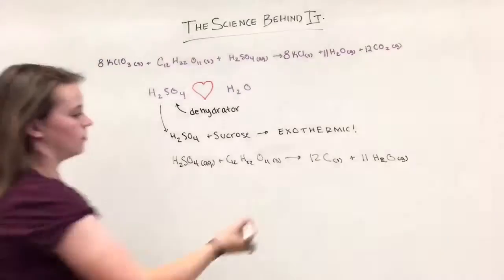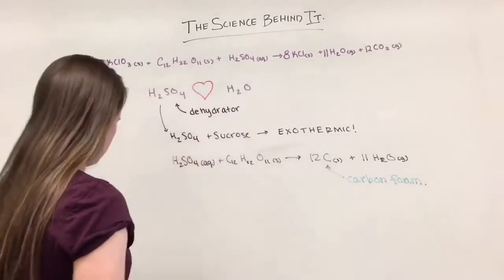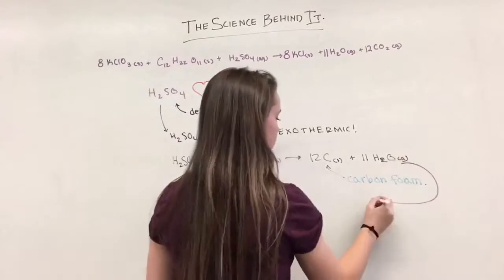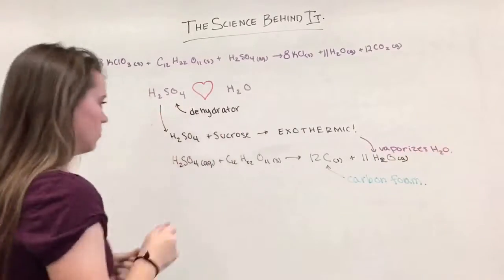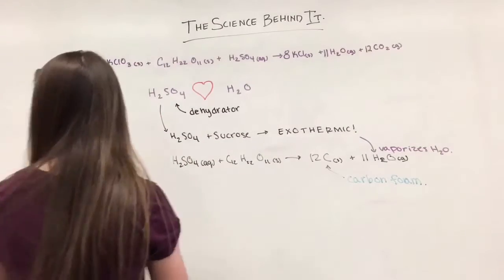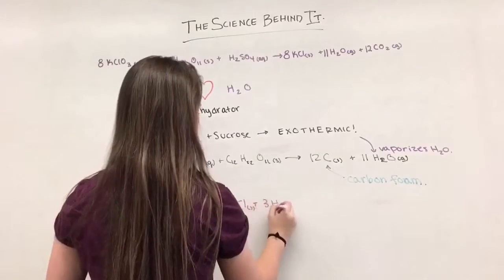This reaction is extremely exothermic. The elemental carbon is referred to as carbon foam because it expands. The water is vaporized by the heat the reaction releases. Sulfuric acid acts as the energy source for the resulting reactions.